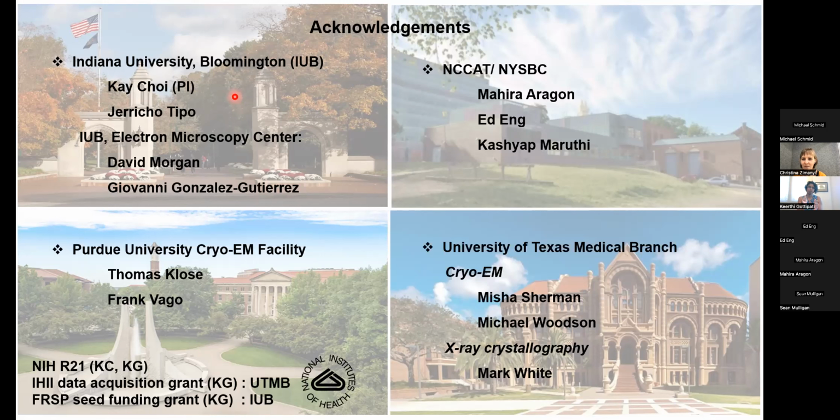But if we are talking about multi-blotting or pre-blotting with protein, I didn't have to wait too long. I pretty much did that within the VitroBot itself. The VitroBot, like I said, allows you to multi-blot. You just add the sample, wait for like 10 seconds, and then wick it out and add your RNA or protein of interest. So that can be timed within the nicely humidified chamber itself.